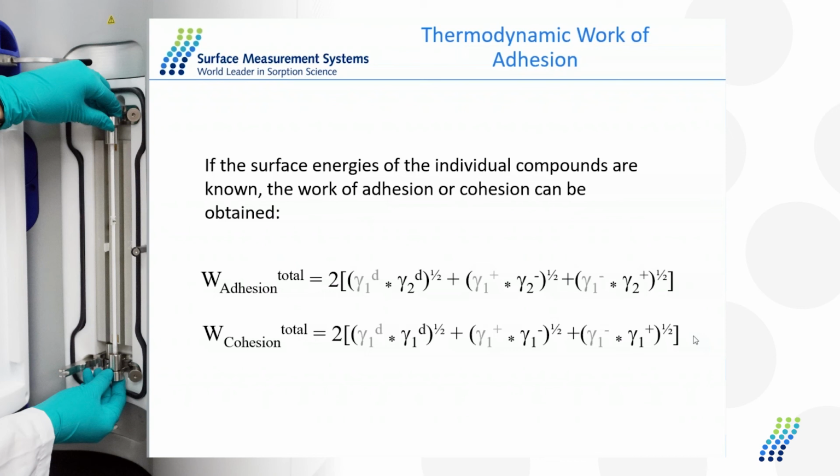Even if your powders are sub-micron size, down to 1 micron, we've run those previously. The only thing you might have to worry about is pressure drop down the column, but we can work with you to help with those challenges. But I don't see anything that would stop you from using pentane or hexane or heptane or octane with 5 micron powders. It shouldn't be a problem. We've done it previously. Are there any other questions that we would like to discuss?